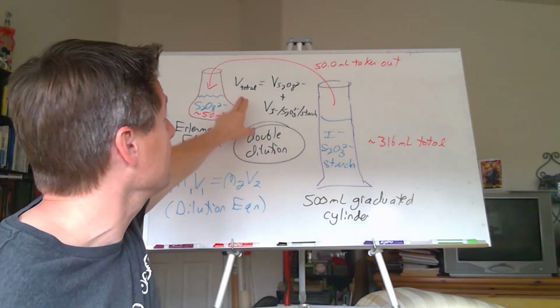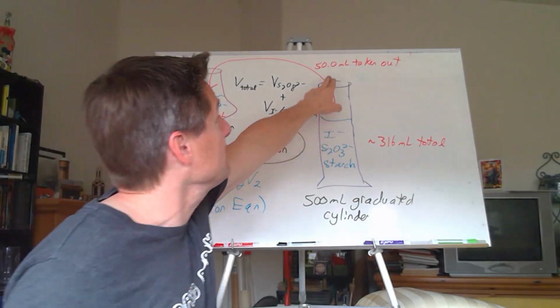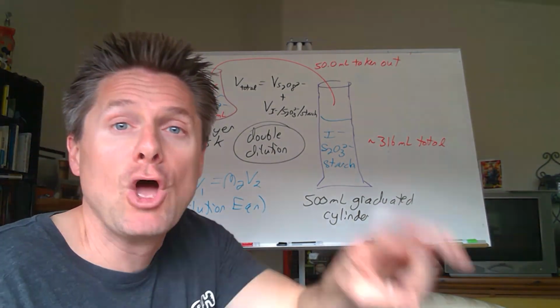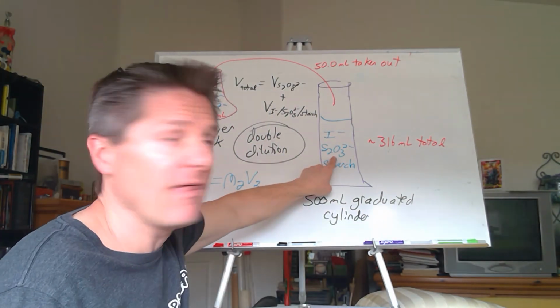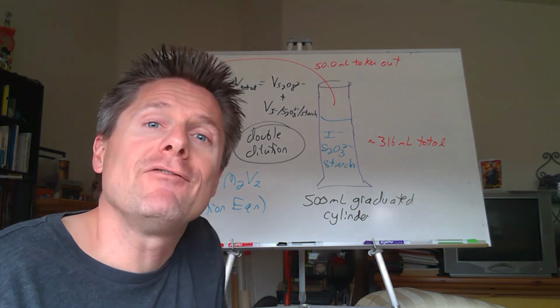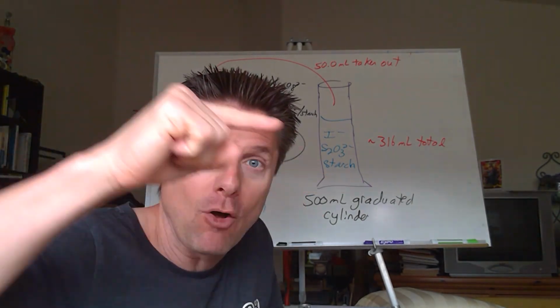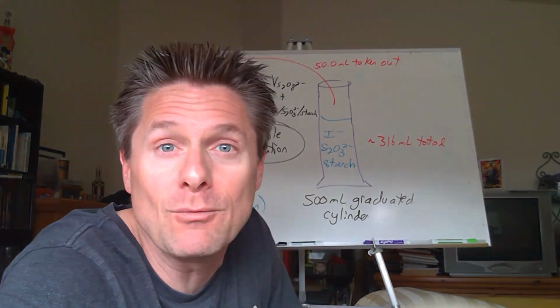That dilutes it because the total final volume will be the volume of the peroxydisulfate plus the 50.0 milliliters of the iodide thiosulfate starch solution. So you're going to do M1V1 equals M2V2 twice for the I-, twice for the thiosulfate, and twice for the peroxydisulfate, and that will give you those initial concentrations just after you mix them, that starting concentration on the graph that I showed you. Then they all go down except the I-, which stays constant, and the S2O3 goes to 0.